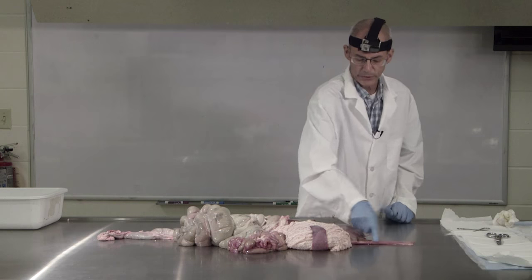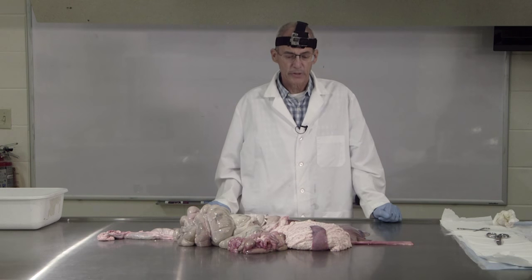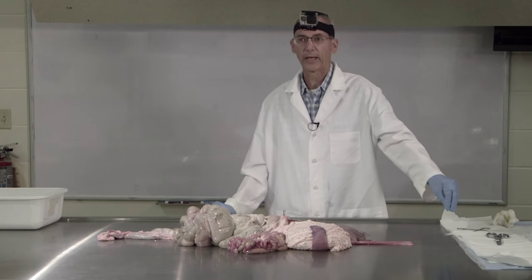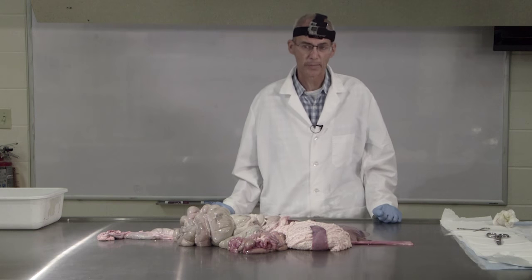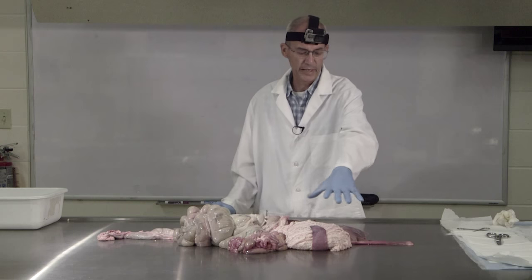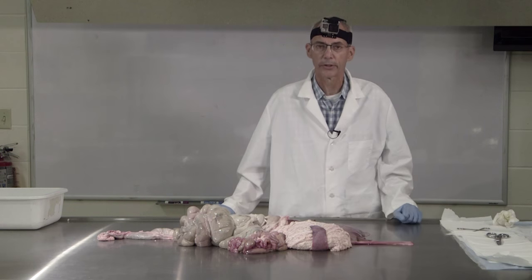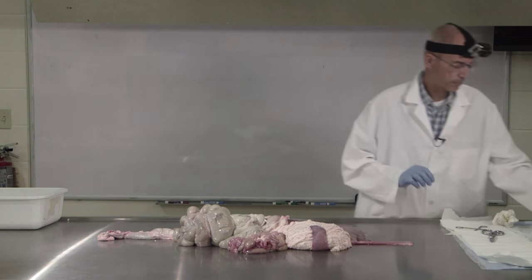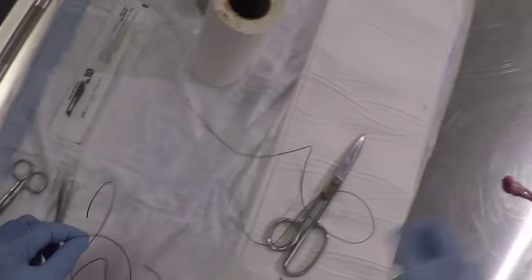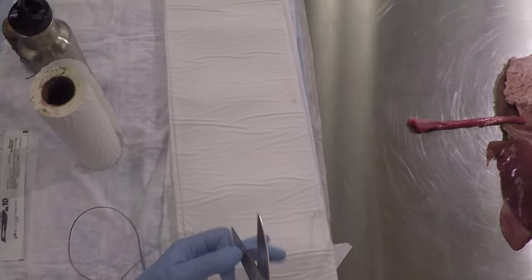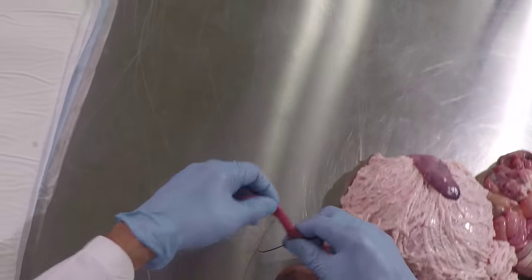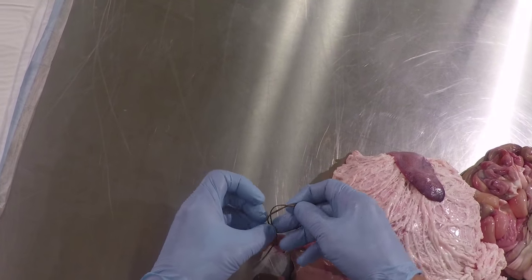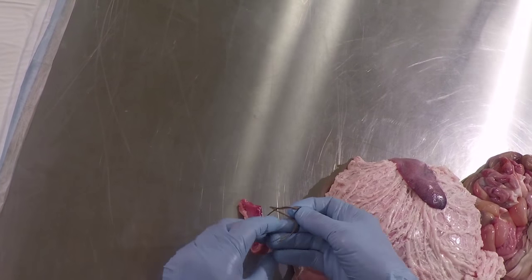We'll start up at the stomach end with the esophagus. The esophagus doesn't really contribute anything to digestion — it's merely a way of moving food from the mouth down to the stomach, passing through the thoracic cavity where the lungs and heart are located. It's essentially just a conduit. I'm going to tie a string around it so that digestive material inside doesn't leak out while we work on dissecting this.